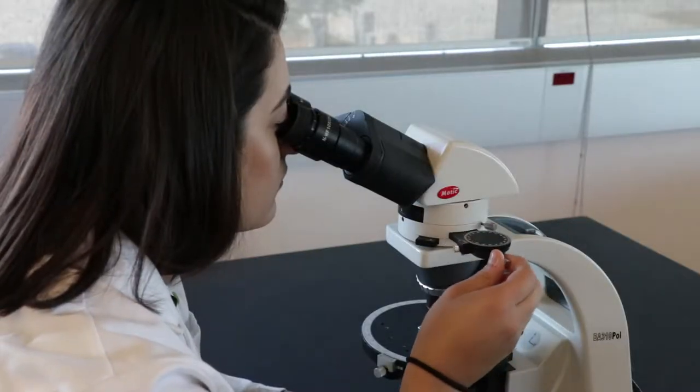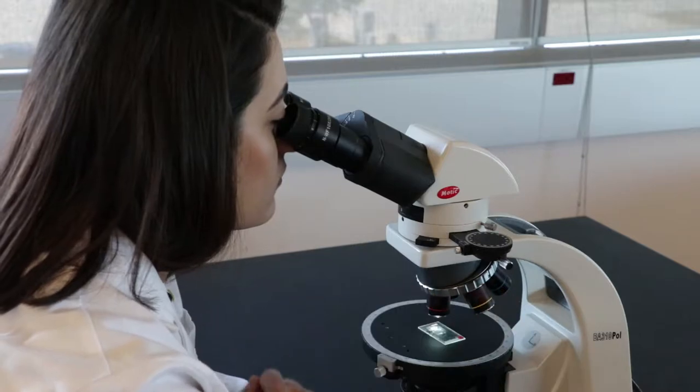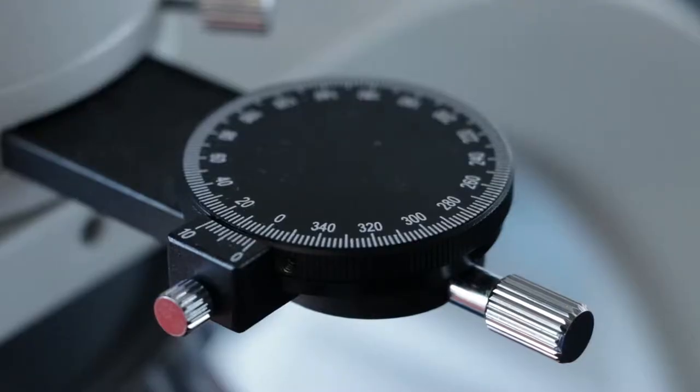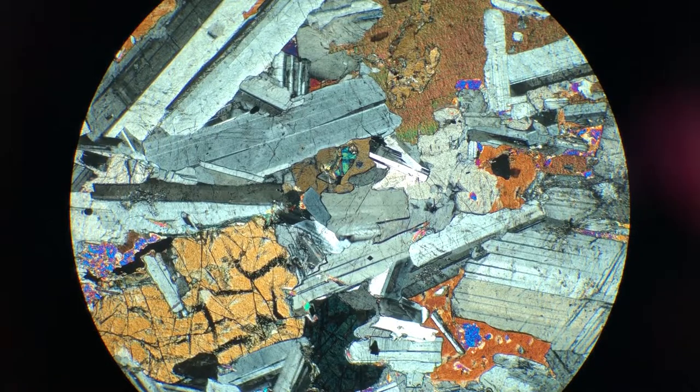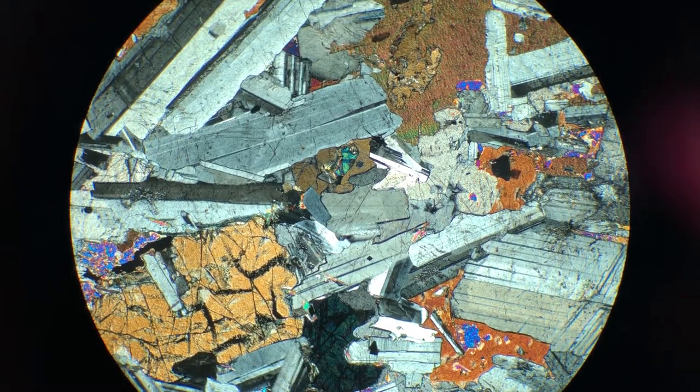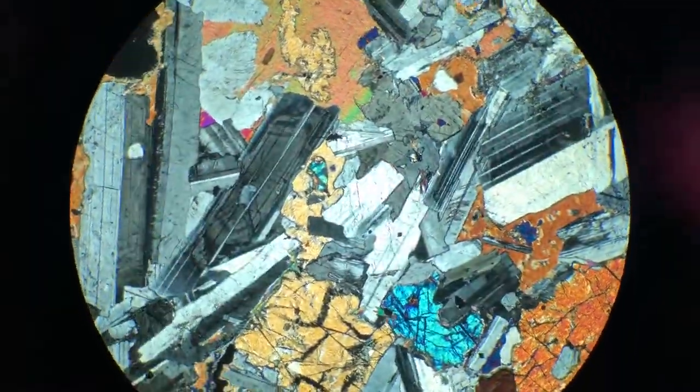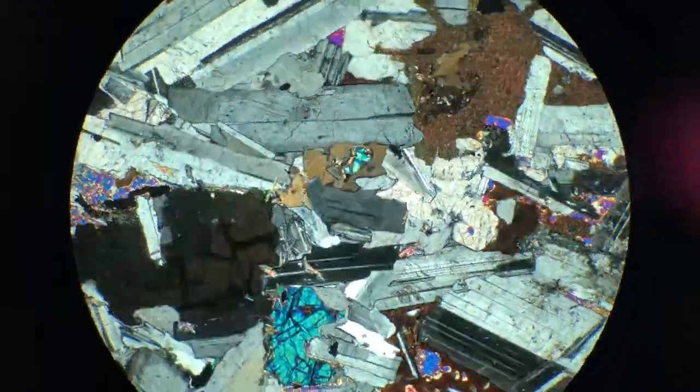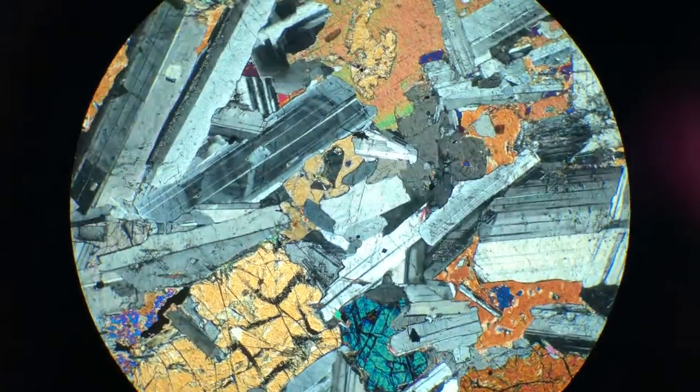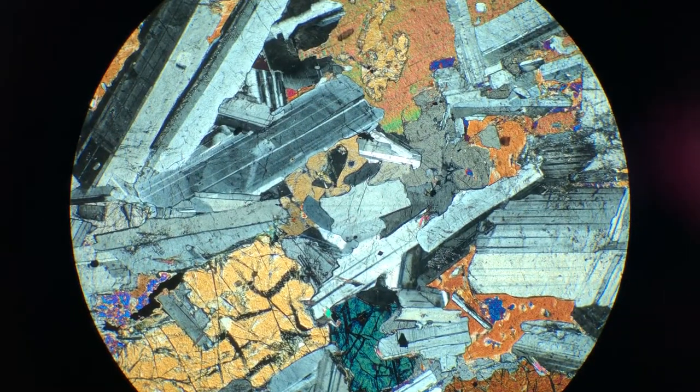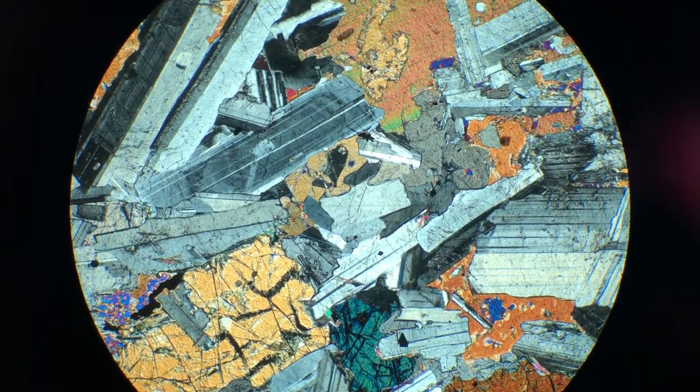Another potential cause for incorrect interference colors is if the analyzer is not in the correct orientation, east to west. Here, you see the correct XPL view of an igneous rock which consists mostly of plagioclase feldspar, showing usually light to dark gray interference colors similar to quartz. They have a rectangular shape with a striped pattern in XPL due to the occurrence of twinning lamellae.